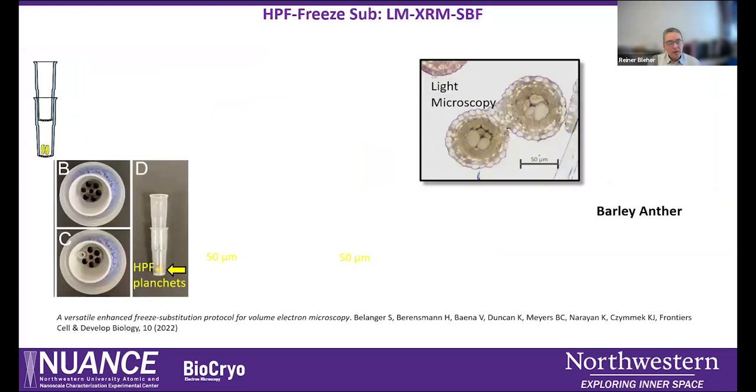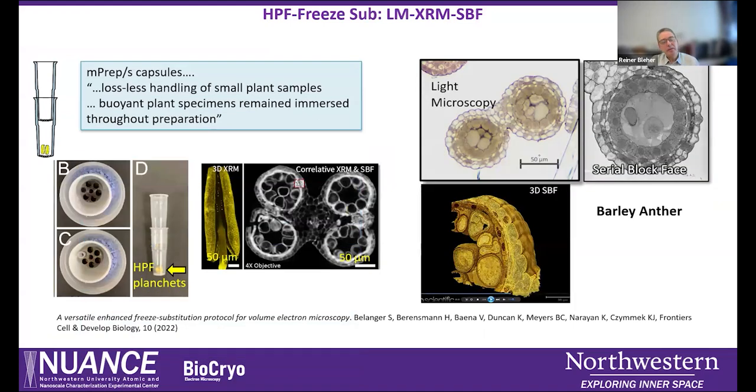One advantage of these capsules is also sometimes we have samples that contain gas or air bubbles, and those samples always would swim up on the surface of solution, and we would never have a real good exchange. And in this case, we also can use capsules either by stacking or by using the screen and keep those samples all the time submerged. So this might give you ideas with your samples. It need not be biological samples, but any sample that needs to go through incubations with solutions can be used, I guess.